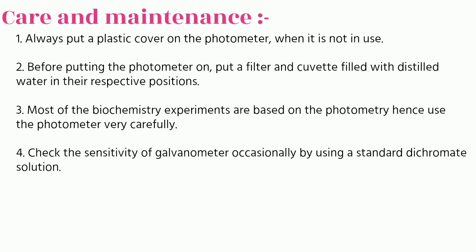So this was all about the colorimeter. In the next lecture we will discuss the Neubauer chamber. So this was all about today's class.